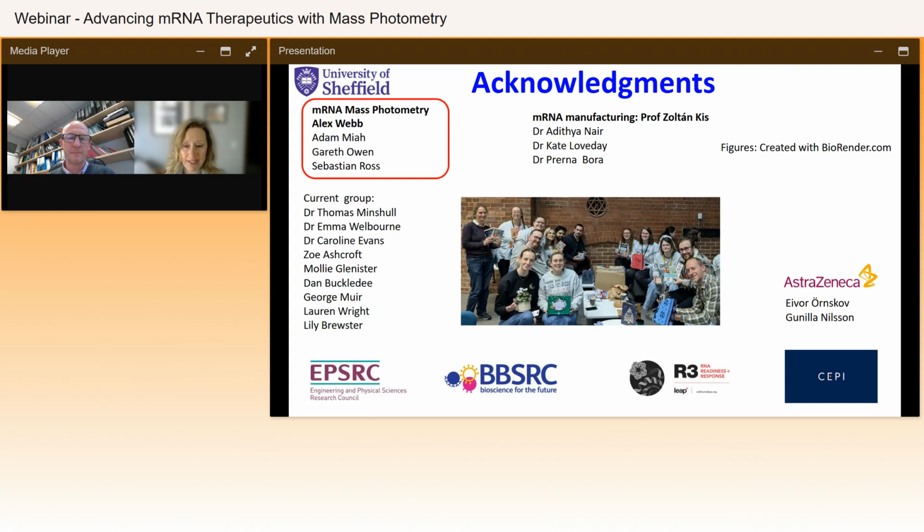Excited to hear how you answer this next one. Excuse me. Can or will mass photometry work on the next step of mRNA therapeutics? That is the mRNA protein interaction, to potentially verify the functionality of the mRNA.